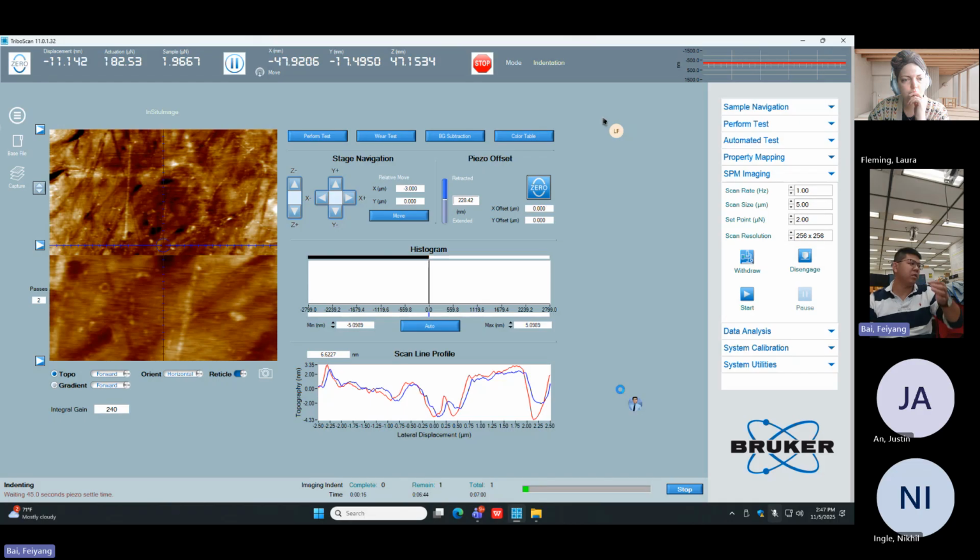So the piezo is the ring thing that clamped the tip, right? No. Let me grab the manual. But I see it small.